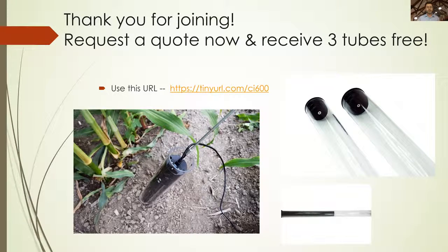The next question I see is, how to install it in, say, a hydroponic setting? That might be a bit more than I can go into detail on here. The thing I do want to mention is that the instrument is actually very resilient to different environmental effects, with the caveat: do not just stick it straight into water. Like most electronics, you don't want to just submerge the whole thing. But even in high moisture, high humidity, we've had it in 95 plus, and it works just fine.